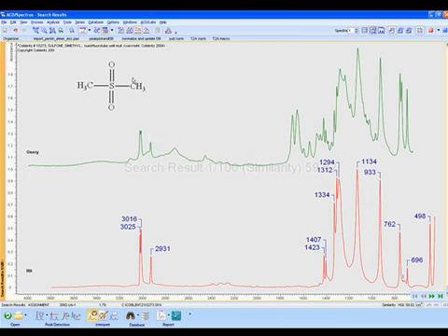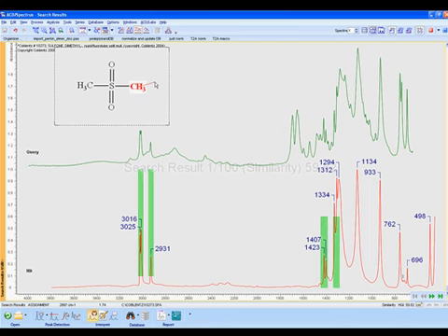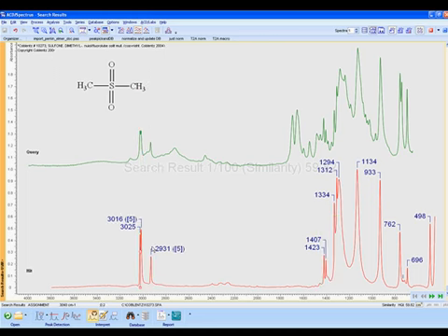With the proposed structure from the database search displayed, we can highlight parts of the structure, and it will overlay on our spectra where it would expect to find those bands. This can give us clues as to what those bands might be. To make a correlation, we can simply control-click on one or more peaks. Once correlated, mousing over either the structure or the peaks will highlight the relationship. In this way, you can make structure spectral correlations and save them to your spectrum.